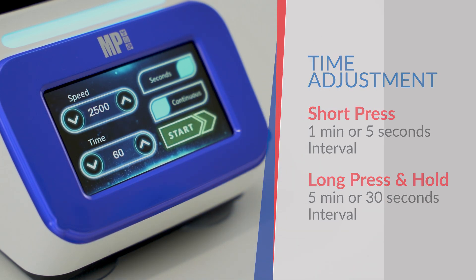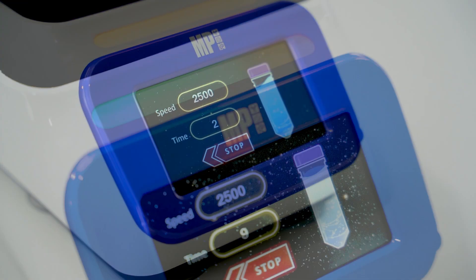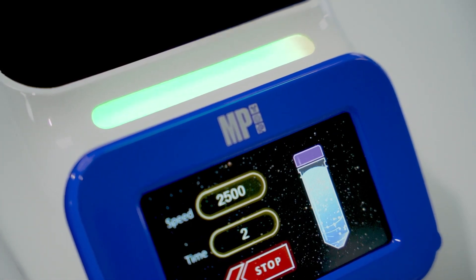After the speed and time are set, press start to begin operation. The machine will rotate at the specified speed and duration, stopping automatically when the cycle is done. The countdown time will be displayed on the LCD screen and can also be observed from the progress light at the top of the machine.